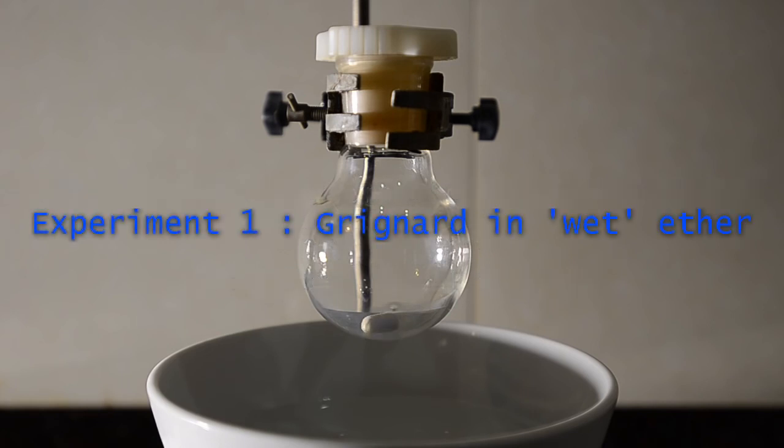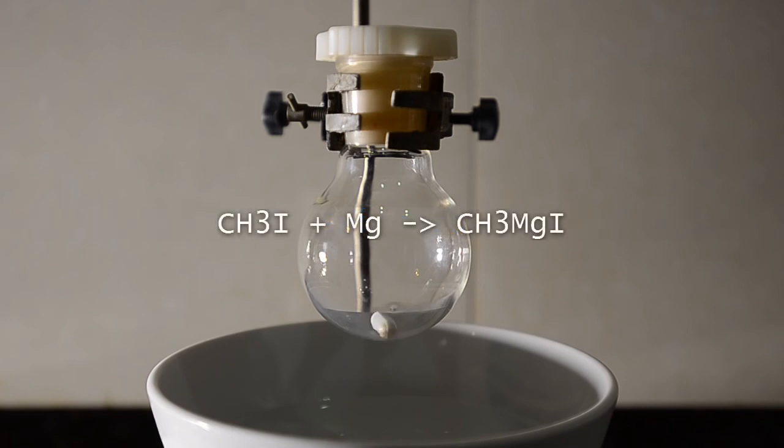So we attempted to make a Grignard reagent using methyl iodide but using some extreme conditions. As a control we dried the 100 ml flask in an oven at 150 degrees C for an hour, then removed it and stoppered it while it cooled.